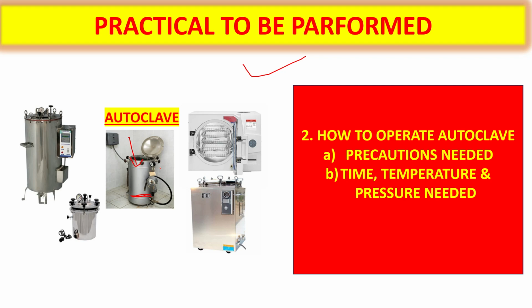Okay, so there are many types of precautions you need before that, and after that we have to set the temperature, time and pressure in the autoclave. All these things you have to perform on your own, and you will be given marks on the basis of your knowledge of the practical, or handling machines.